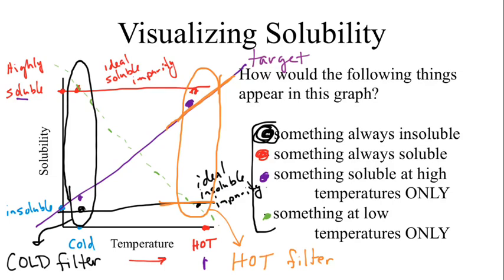So the idea with a lot of our crystallization steps and purification schemes is manipulating this graph and trying to decide where different phases are, and how we can separate them at each stage. Okay, so it's a little bit tricky to get through.